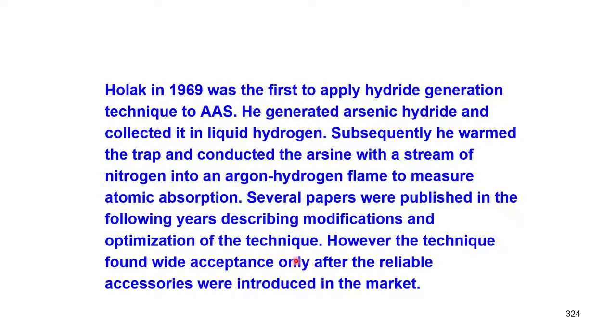However, the technique found wide acceptance only after reliable accessories were introduced into the market, because generation of arsine is a little bit of a problem if you do not have good equipment.